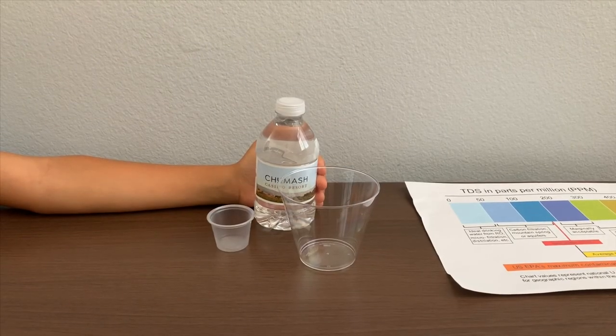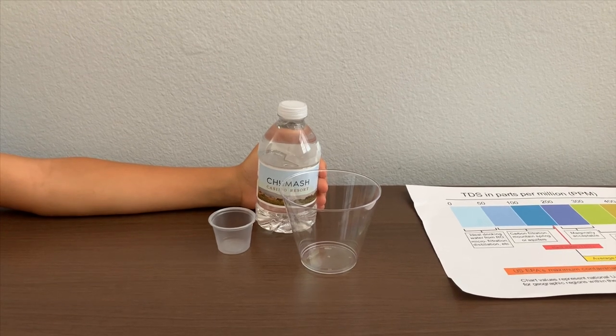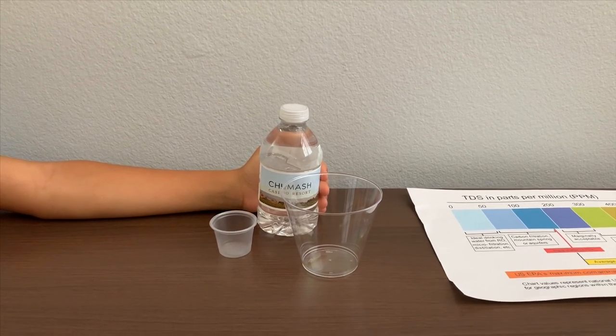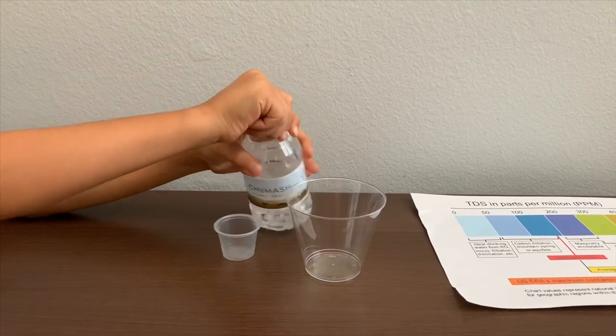This is Chumos Casino Resort Water. We got it from a hotel in California and it's purified by reverse osmosis. Let's pour some water in.